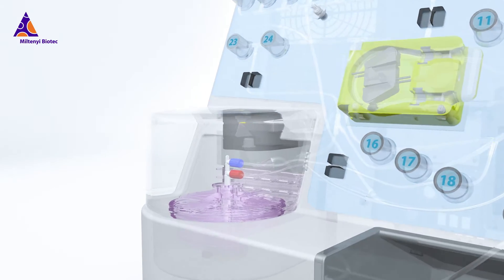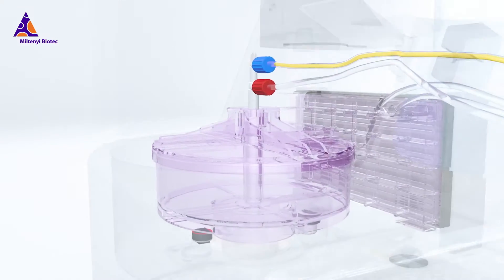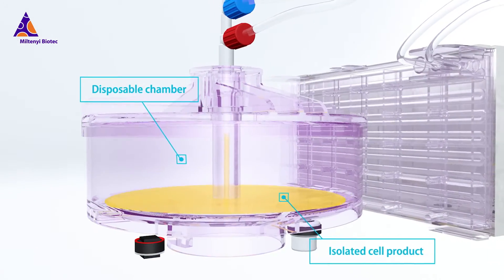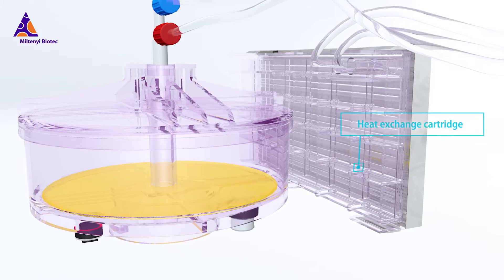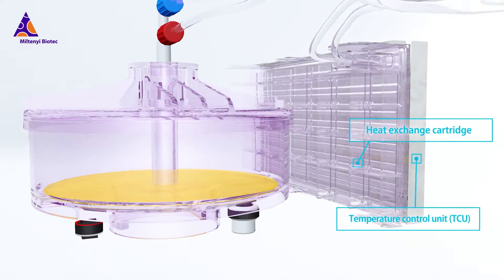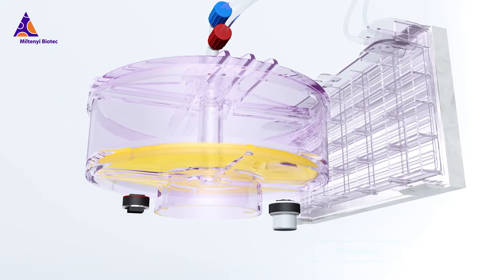Automated cell expansion occurs in the disposable cultivation chamber. The chamber is part of the Clinimax Prodigy tubing set, which is designed to maintain a closed system for cell processing.